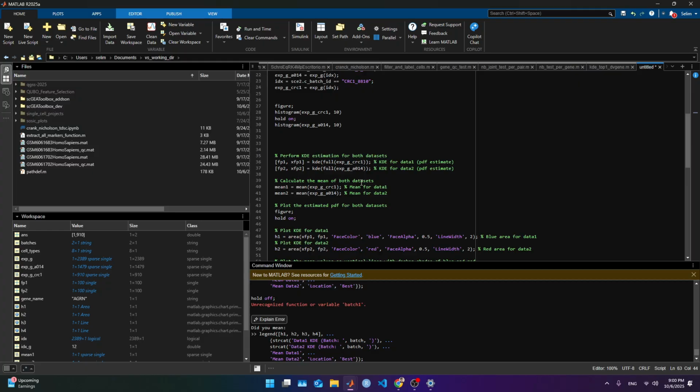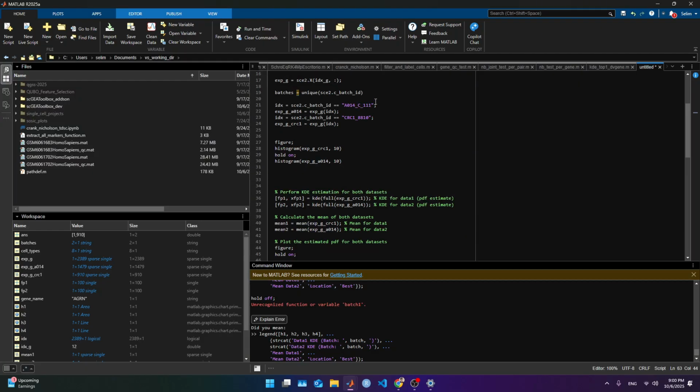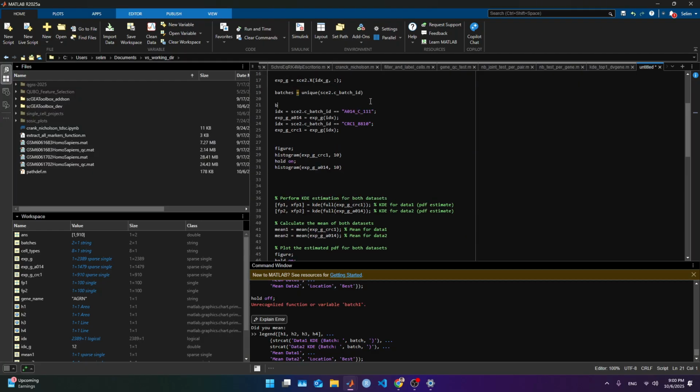Batch 1, it's gonna be, my bad. So we can code it here. Batch 1 equals to that. Batch 1. And here we can change it to batch 1.